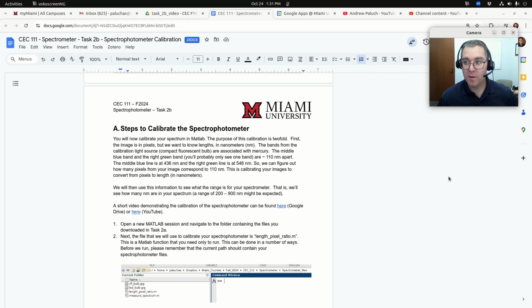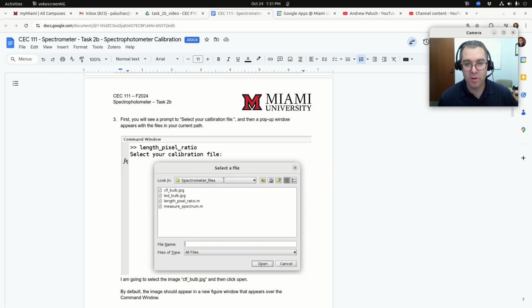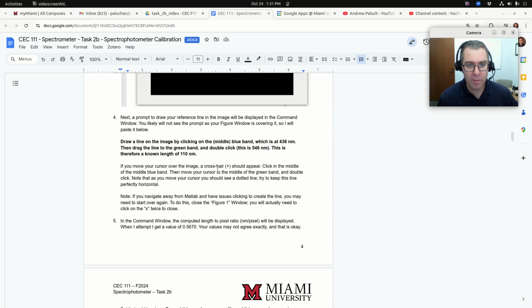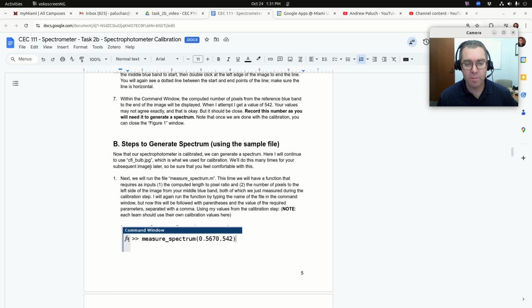All right, hello. So I'm here still in task 2B for the spectrophotometer project. I just recorded a short video which I shared with you looking at part A, which is the calibration of the spectrophotometer. In part A, we computed the pixel ratio, which was the first task, and then we computed the distance to the left edge of the image. So what we're going to do in B now is, using that same image and those two reference values, generate a spectrum.